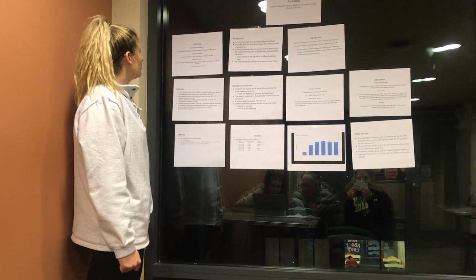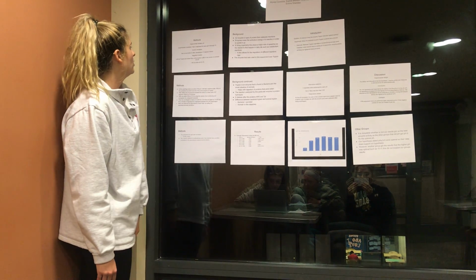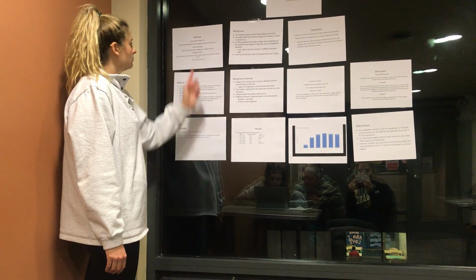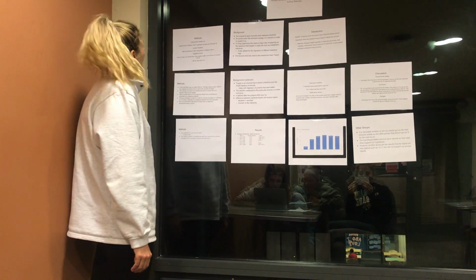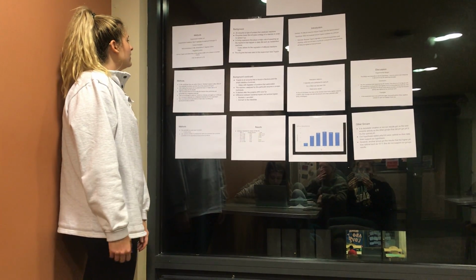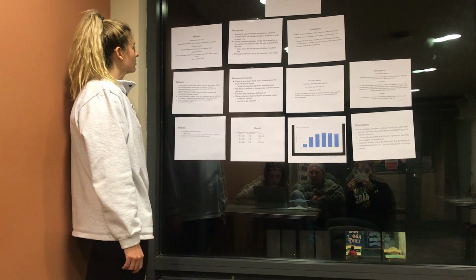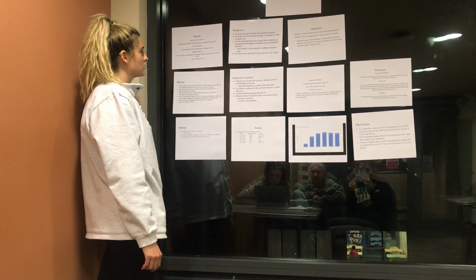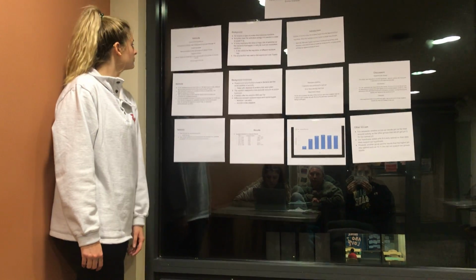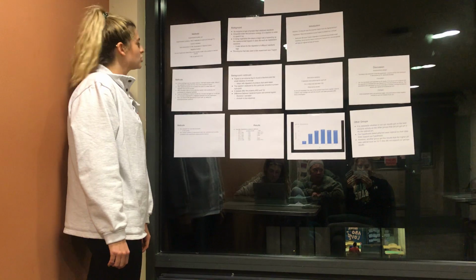Our control variables were salt concentration, 0.15 moles, and a temperature of 37 degrees Celsius. For our negative control, we left out trypsin and added 50 microliters of the reaction buffer to the solution to maintain volume. And then we had 1 negative control for each pH.